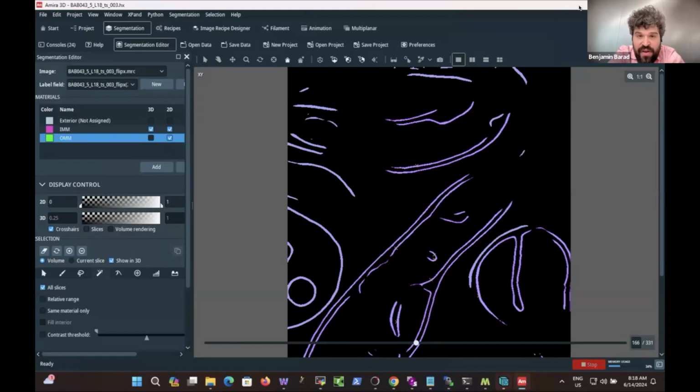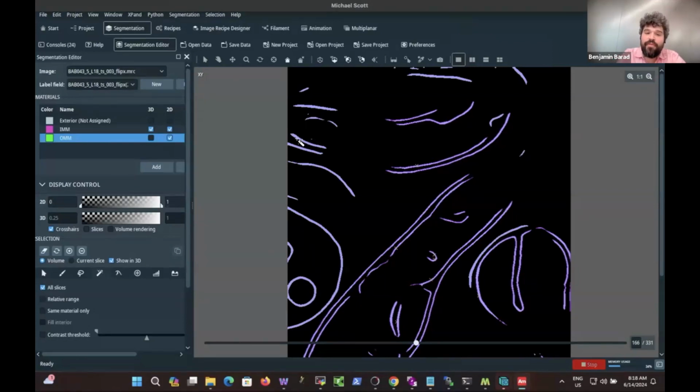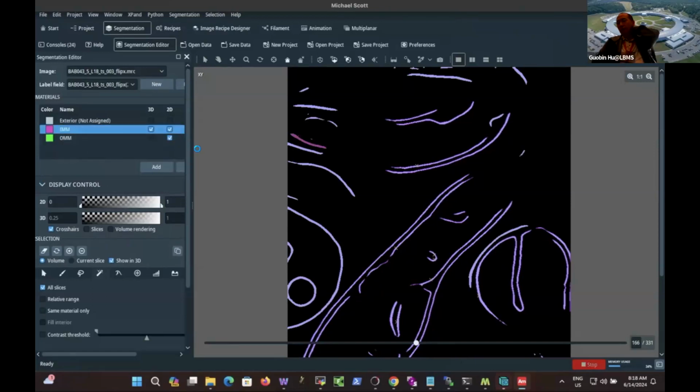It's aligning tilt series well. There's a lot of manual steps in that. It's particle picking. It's segmentation. That is very much the challenge of tomography, that there are a lot of steps in segmentation that are not fully automated yet, and that we'd like to be automated.